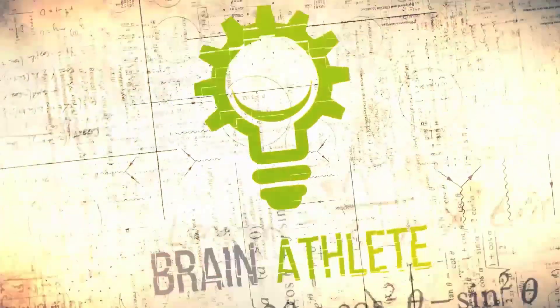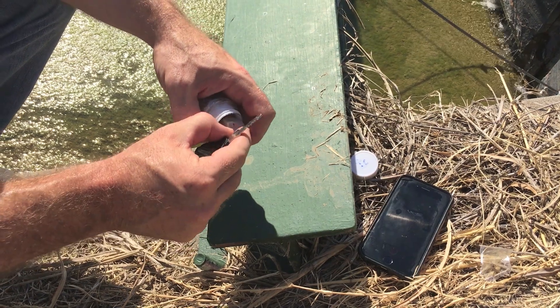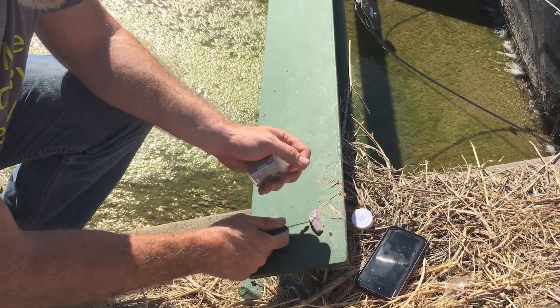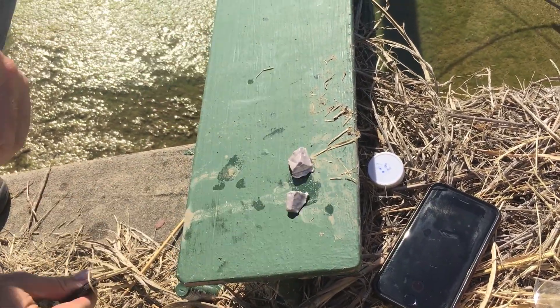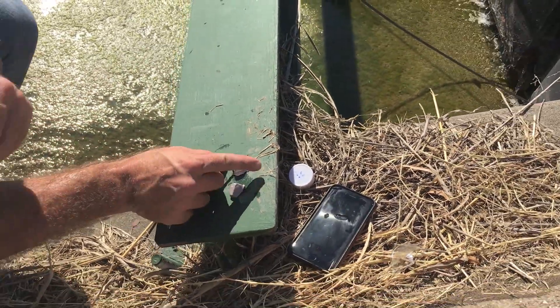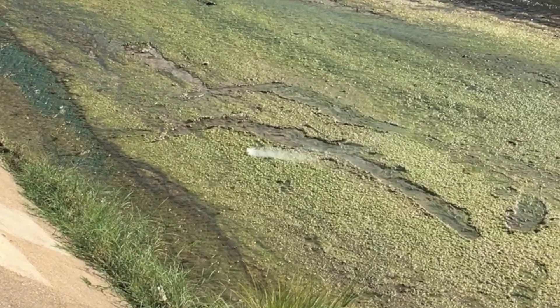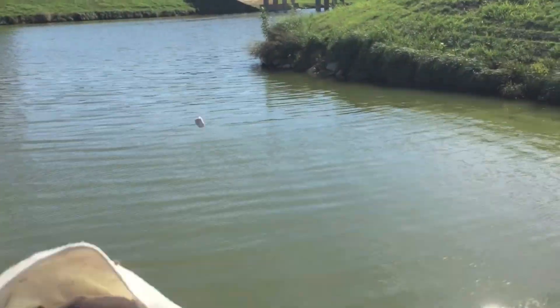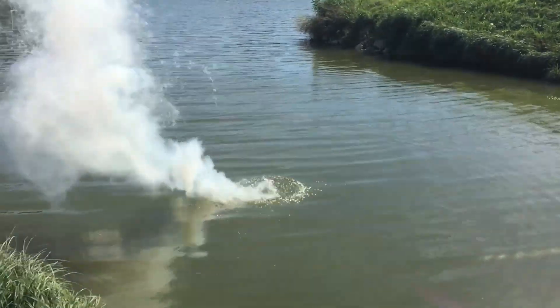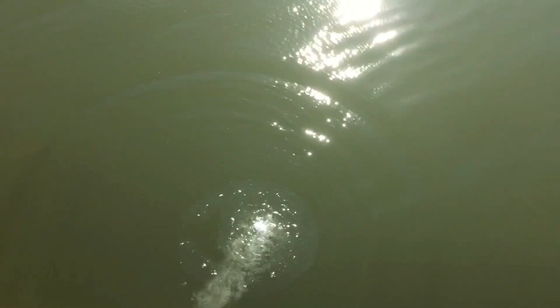Check this out. Sodium metal is very soft, so you should be able to just cut it with a key. Something that soft you wouldn't think would be dangerous, but check this out. It's gone — where'd it go? It's gone.